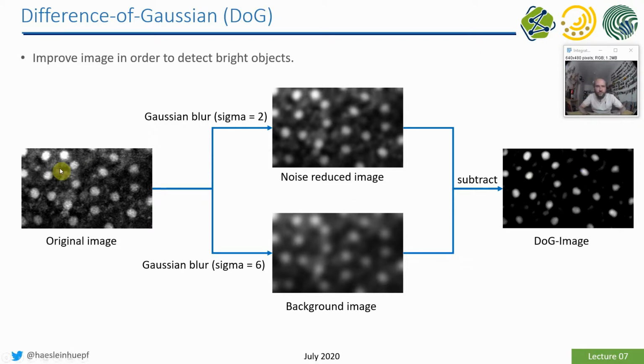When you look here in the original image, there were some gray regions between these nuclei, which are now gone in the background removed image. So removing background is removing something big in the image, some regions which are brighter compared to other regions, making them all similarly bright. That's background removal. And on a very local scale, in small regions, removing these fluctuations of pixel intensities, noise, that's noise removal. So that's the difference between background removal and noise removal.